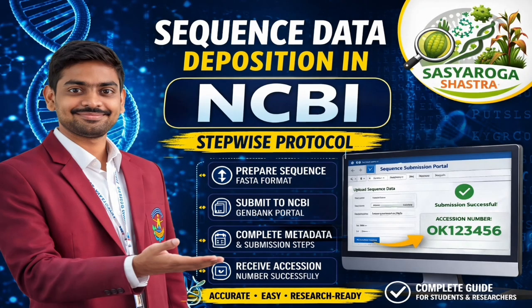YouTube channel Deposition. Today in this video, I will be telling you all how you can deposit your sequence data in the NCBI portal and get your accession number, which is most important for writing the thesis as well as to publish the papers.